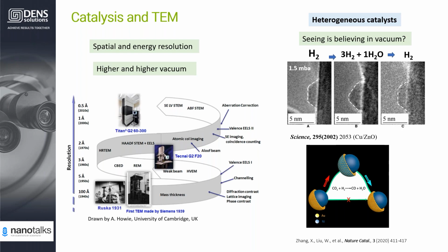As we can see, both of them have the same morphology and structure at the beginning and at the end, while in the reaction process, differences show up. It tells us the real active state will not be revealed by pre- and post-mortem analysis in high vacuum.